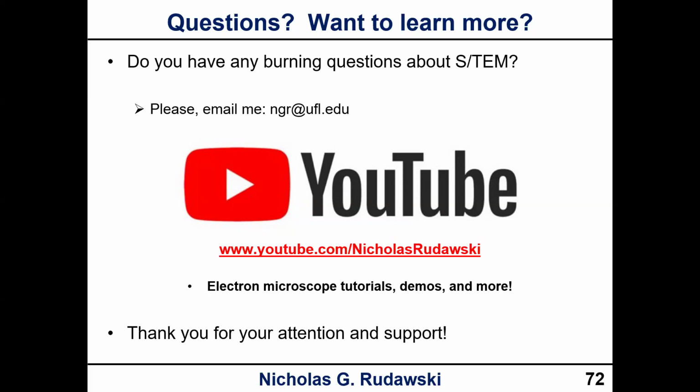Thank you, Nick. This next one is from Rahu Agarwal. Is it possible to image different atoms in a single phase substitutional solid solution?